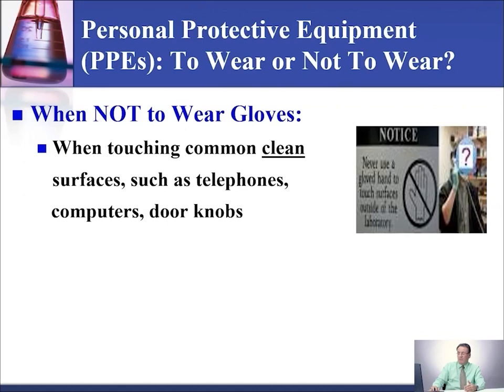Okay, but in an office, in a clean area, in a conference room, you cannot go with the gloves and touch these items. If you are going outside of the lab, even the transporters, or if you want to take a specimen from one section to another and you have to walk through a hallway, you don't wear gloves. You have to take your gloves off in the section, okay?